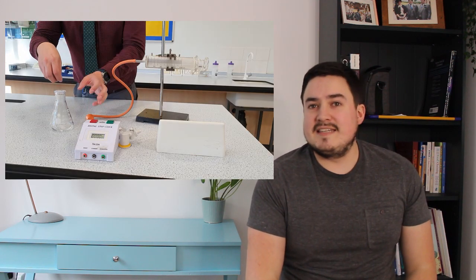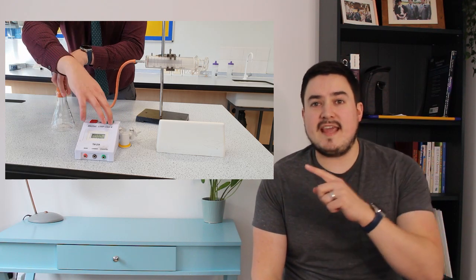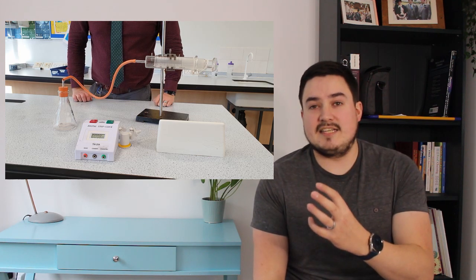The second way to measure the rate of a reaction is to measure the volume of gas given off over time. In this video, I am mixing together some hydrochloric acid and marble chips, and you can clearly see I've got the gas syringe set up to accept that gas as it's released.